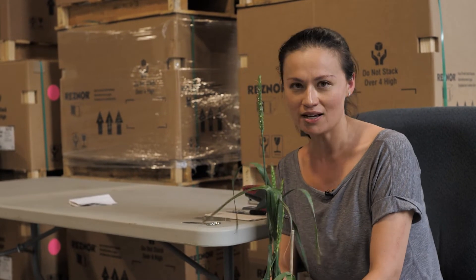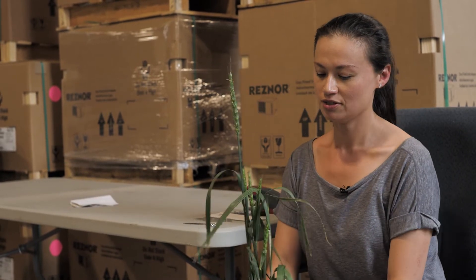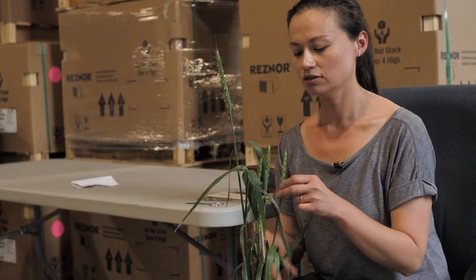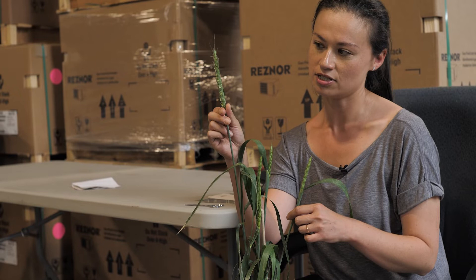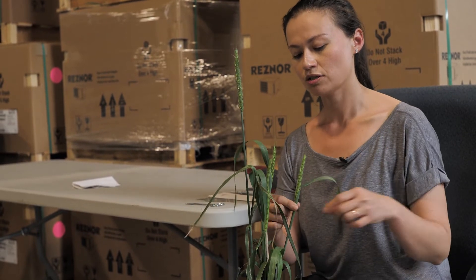The start of creating a variety is crossing, and when you cross you need to pick your parents. You pick your female plant as the egg donor and your male plant as the pollen donor. For the female plant, you need to make sure some heads are coming out of the boot but not fully emerged — here the head is about 75% emerged, which is ideal.